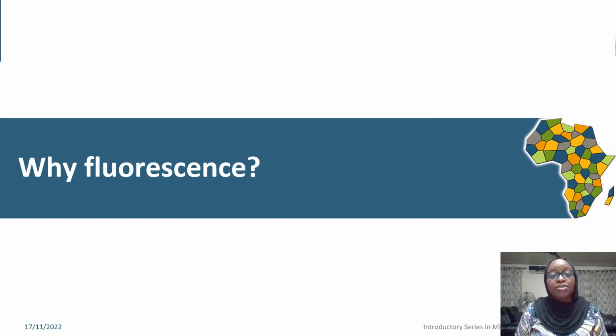Why fluorescence? Why do you choose fluorescence over other types of microscopic modalities? This is mainly because it is used to differentiate between objects. It's an important tool for observing the distribution of specific molecules.